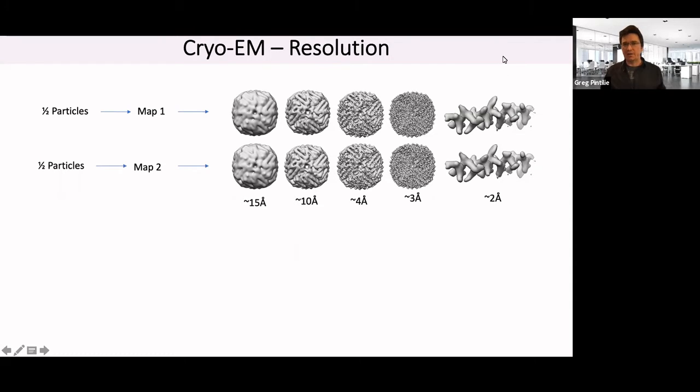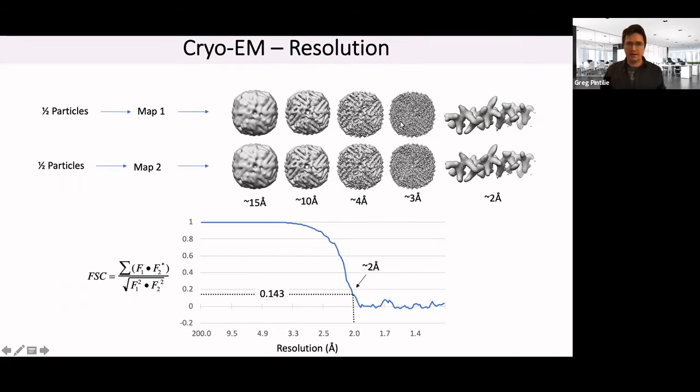They look pretty similar. However, there might be small differences in the small bumps and different features around them. But to calculate the resolution, we take the final maps and convert them into Fourier space. In Fourier space, we can look at different frequencies, and the features at a lower frequency might look similar.